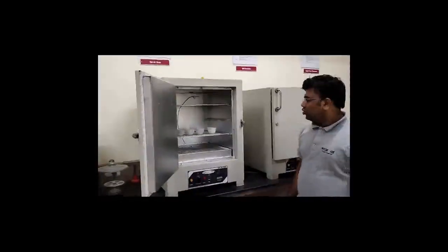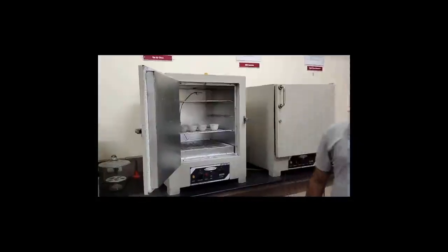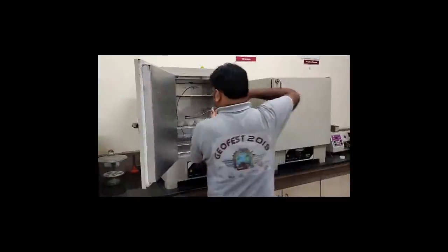Right, so we can take out these crucibles with the help of the tongs that we have, and we'll have to cool these crucibles for some time.